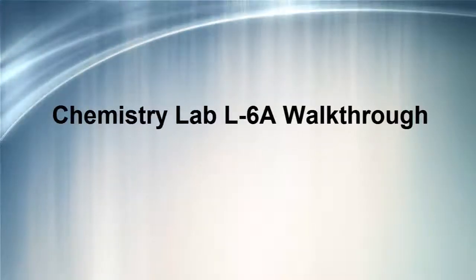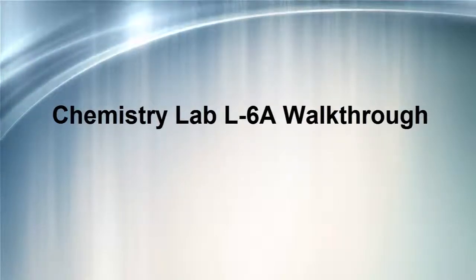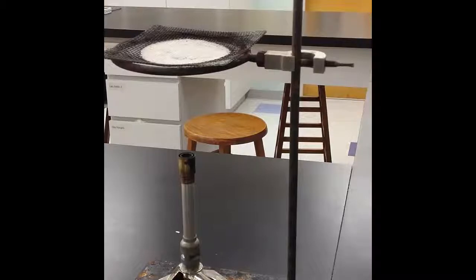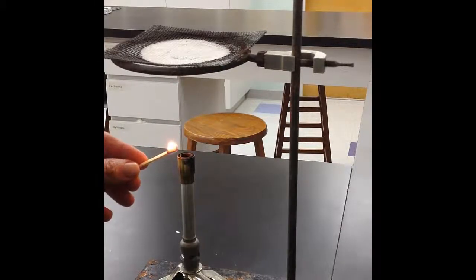Welcome to the walkthrough for Chemistry Lab 6A, identifying bond types by physical properties. The objective of this lab is to identify the type of bond in several compounds based on their physical properties.